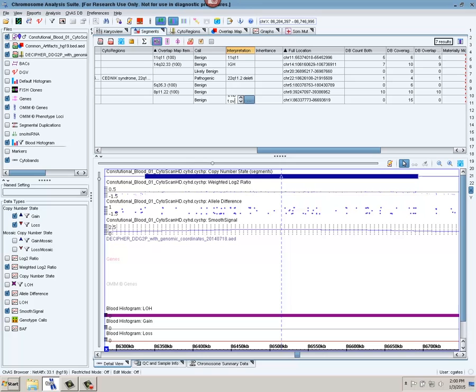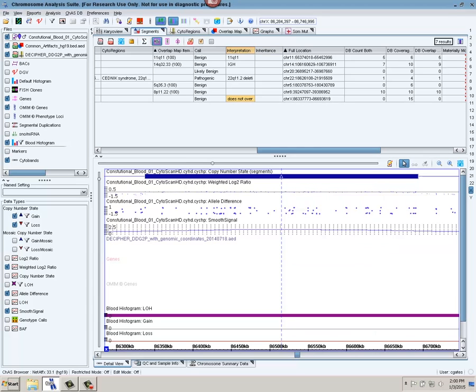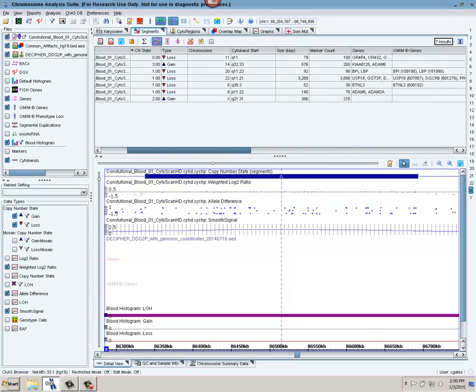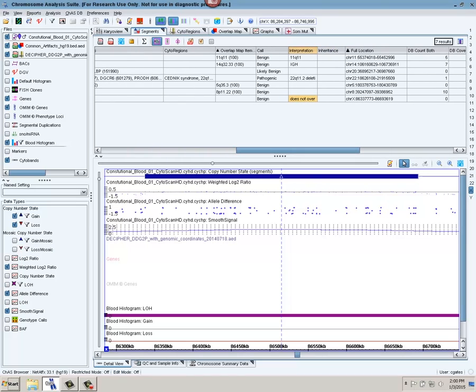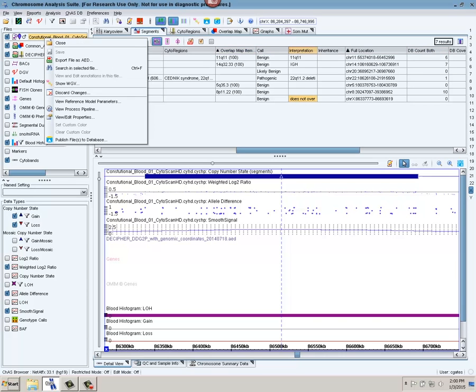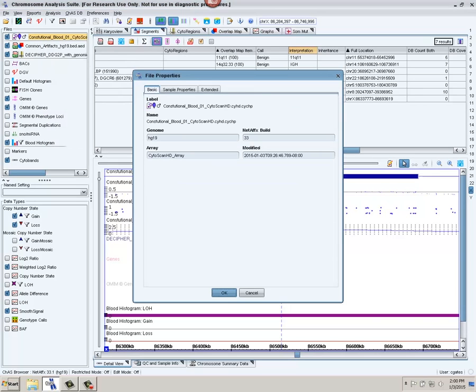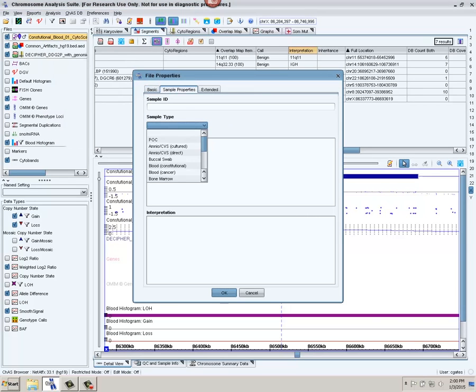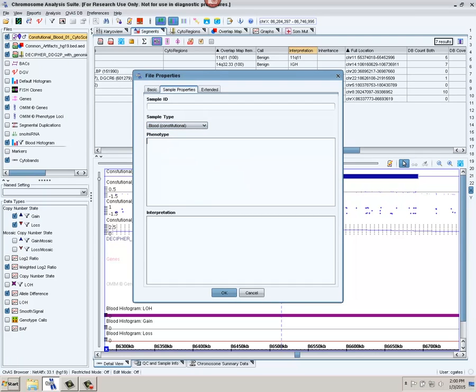For instance, does not overlap any clinically relevant genes. Okay, so I have now looked at all the copy number segments in my sample, and I believe I have found what is to be pathogenic because I have seen it before in my database. So now I'm going to right-click on this particular sample, view edit properties.